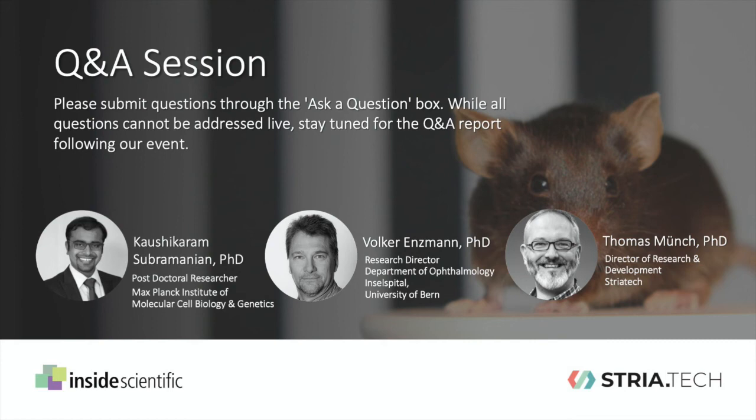The other example are albino mice. Here, the data is also inconsistent between studies. Some studies find that they do not have an optomotor reflex. Other studies find that they do have the reflex, but reversed. They reflexively move their heads in the wrong direction, opposite of the moving stripe pattern. This is due to a mistake in axonal crossing at the optic chiasm.